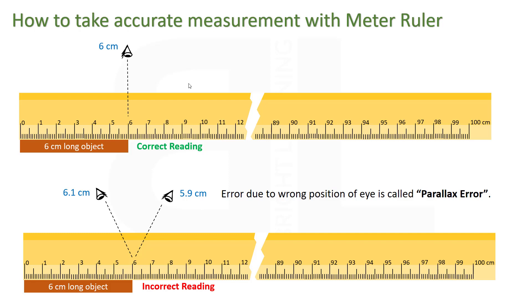So in order to measure the correct length of an object, you should keep your eye just vertically at the meter ruler.